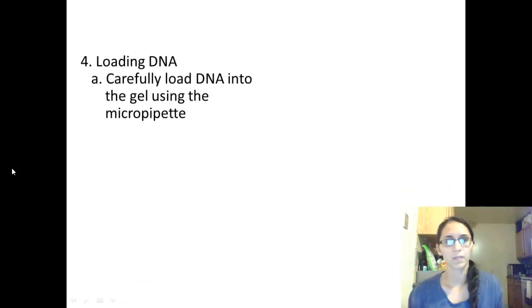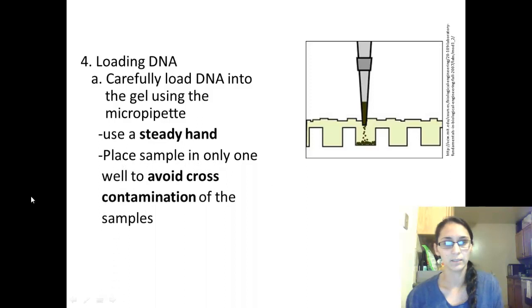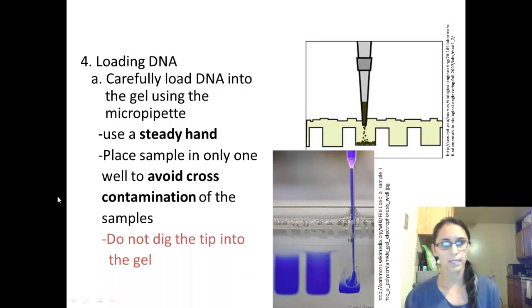Next, loading the DNA. You want to carefully load the DNA into the gel using a micropipette. Here's the cartoon image of a micropipette loading it into a little well. Use a steady hand, and place the sample only in one well to avoid cross-contamination of samples. You don't want DNA from this well to get into this well where you're going to place another sample. Here's a real-life image of a micropipette and the sample being placed into a well. You don't want to dig your tip deep into the well either.